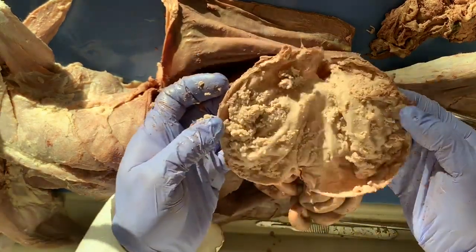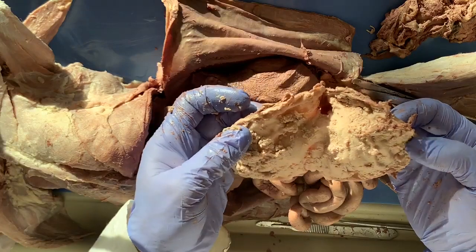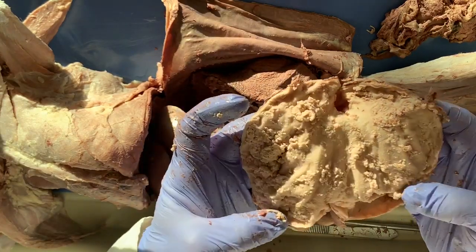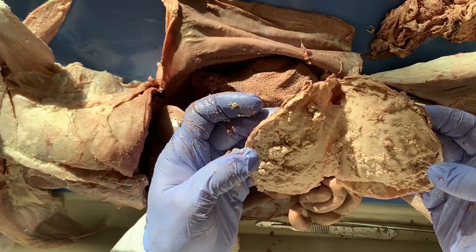So, not terribly exciting. What we're looking at primarily is just kibble. Sometimes you'll see insects in here, sometimes you'll see hair, sometimes you'll see worms. Mine is a little bit boring. So let me wash this out, and then I can go over the parts of it with you.